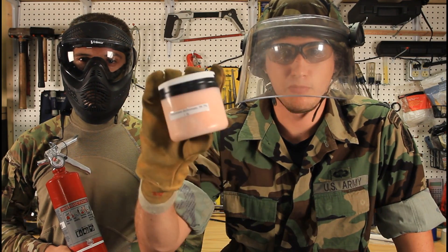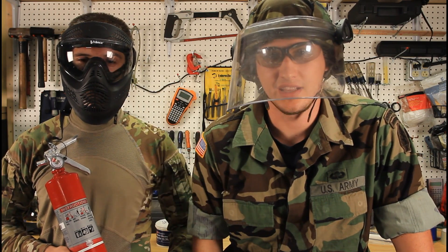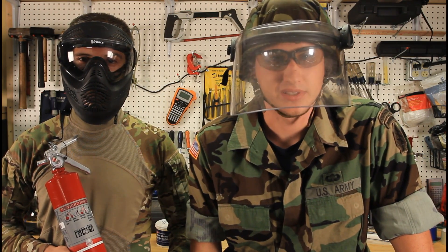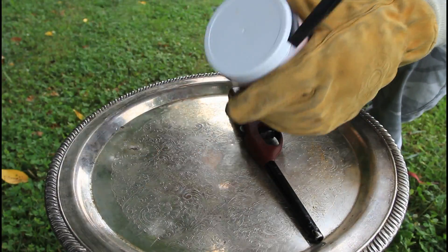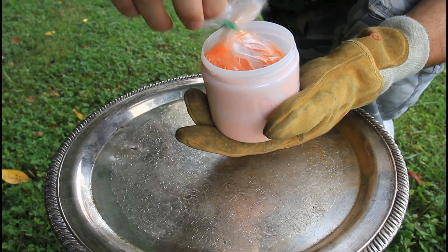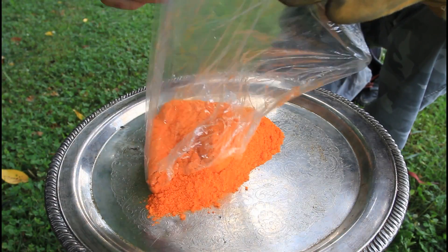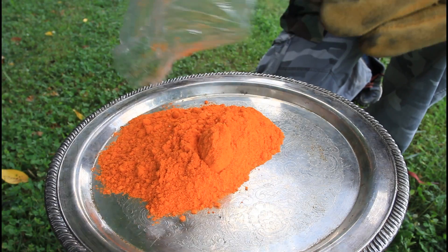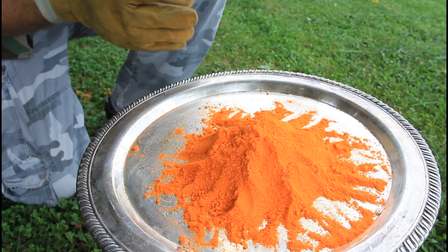All we're gonna need is ammonium dichromate, 99.7%, and a lighter. Let's go see what happens. We're gonna open it — see, we got that powder in there — and I'm just gonna pour the whole amount in the middle of the tray. Alright, we're gonna make it look like a small mountain, and then we're gonna light it up.